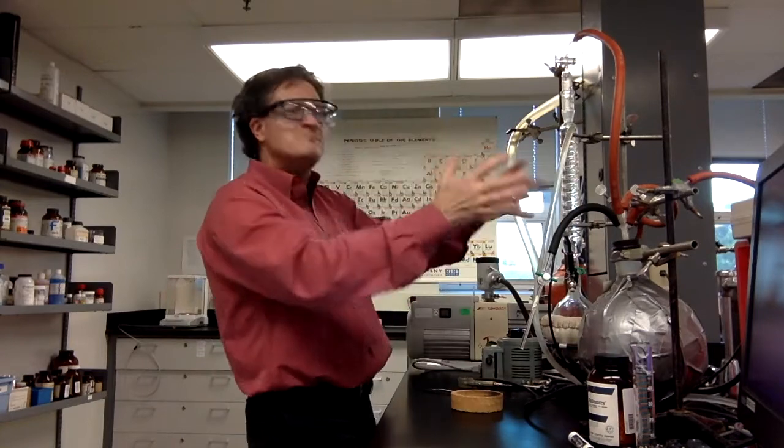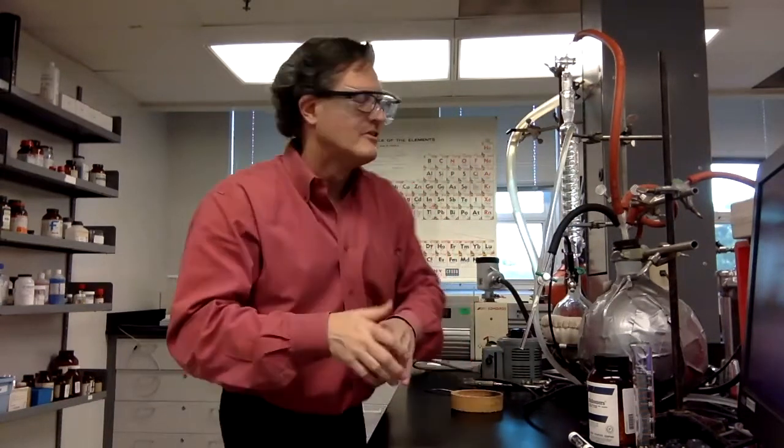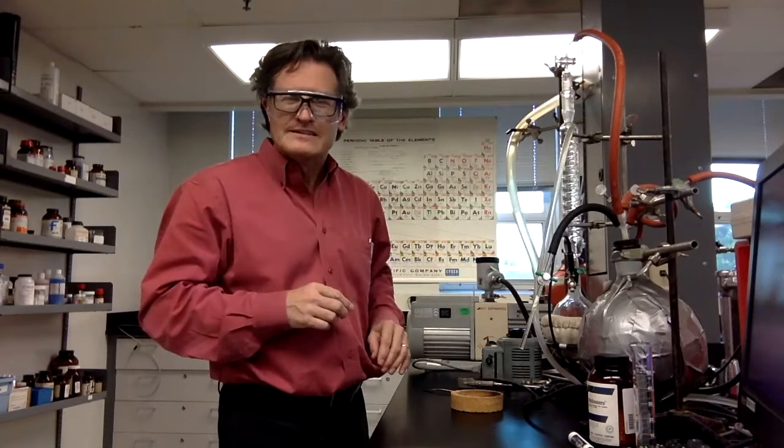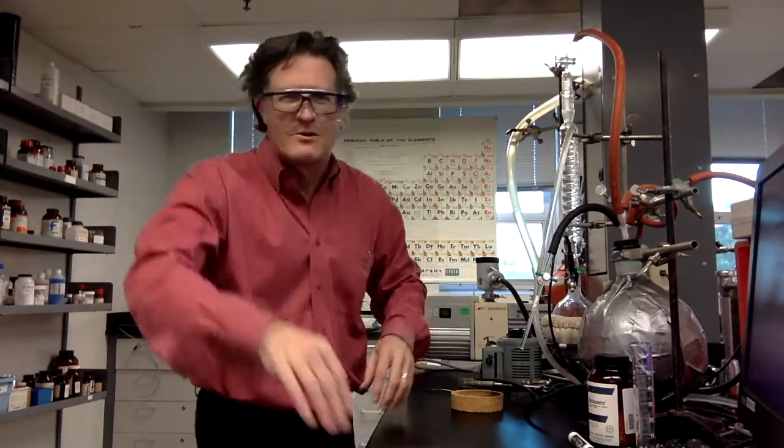Because it's a vacuum chamber, but atmospheric pressure and below, we don't want to go above 100 kilopascal, so nothing blows up, right? We try to avoid blowing things up. If you're going to blow anything up, go to organic lab. So go ahead and blow things up there. Not here, right? Don't tell them I sent you.